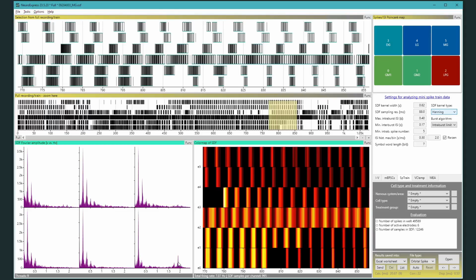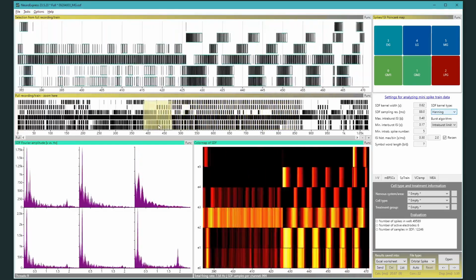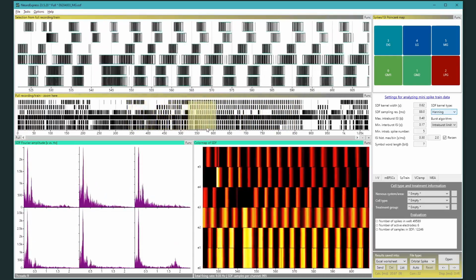These are not FFT graphs. The program uses the traditional slow method to calculate the spectra, but the speed is still impressive. The spectra are updated almost instantly as you drag the zoom window.